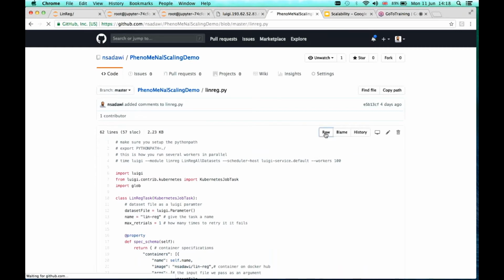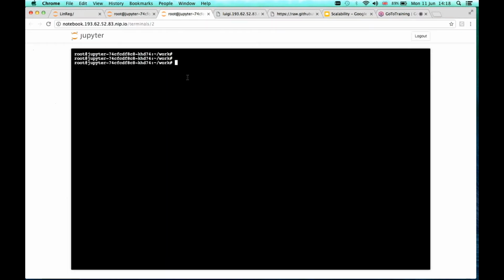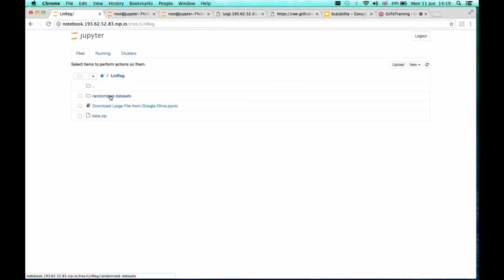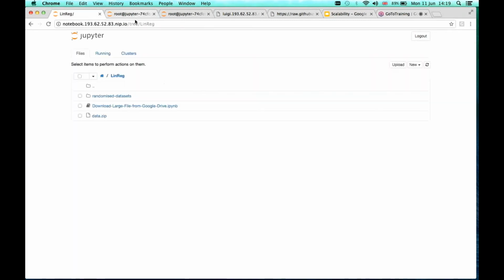So let me download this file to the notebook, and then I'll show you and explain the contents in detail. So I've downloaded the file. If I go here, sorry, I need to move it to the linreg folder. I'm sorry. There you go, it's there.